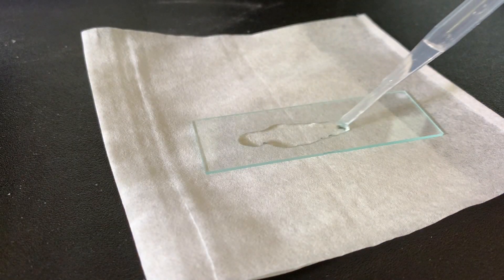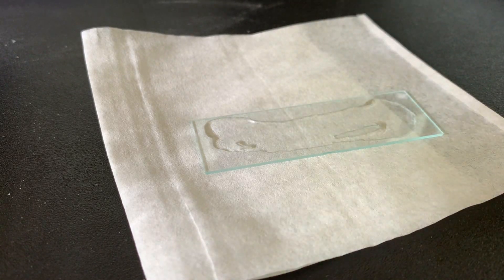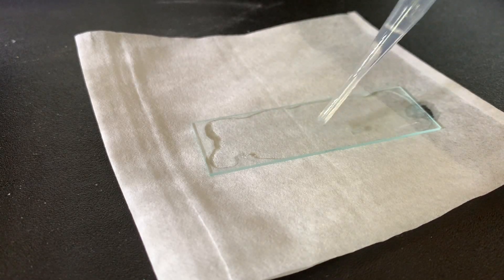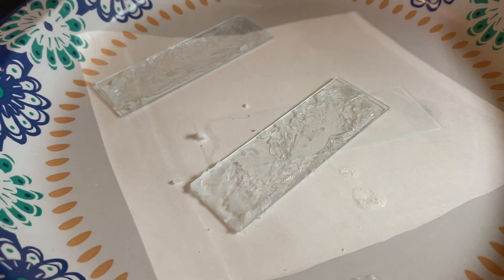The idea of dissolving it and then letting all the water evaporate to look at the crystals again is that hopefully the crystals grow across the slide instead of growing straight up. That way we get a good view of the crystals without having to zoom in or out too much.